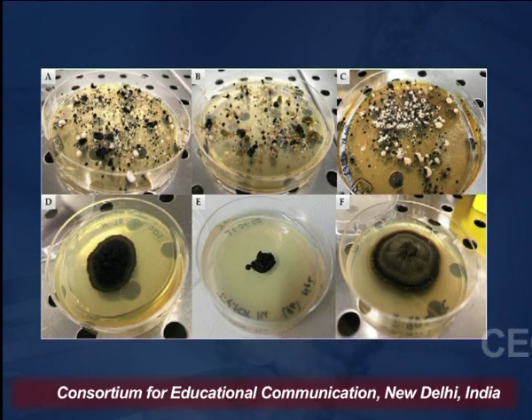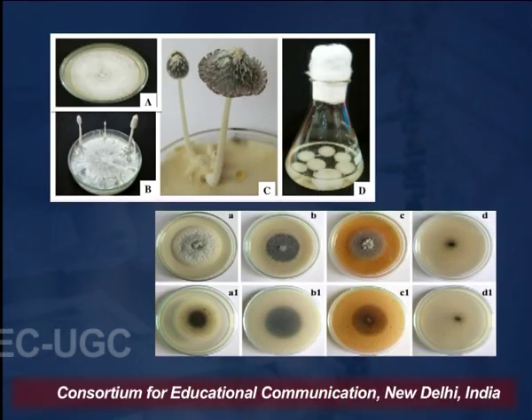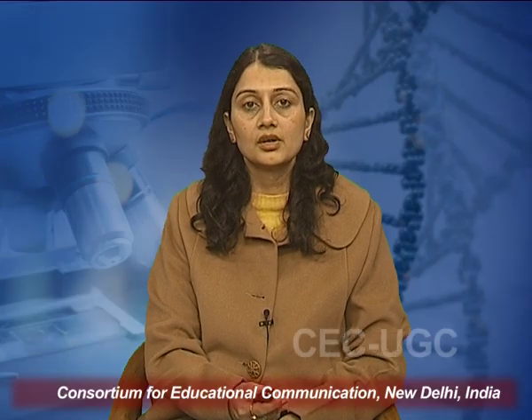In microbiology, you have to use a combination of physical and chemical disinfection techniques. So physiochemical techniques. This is how the fungal growth will look in the slides. Now let's discuss the growth media depending upon the functional type. Earlier we discussed the media depending upon the consistency. Now we are discussing based upon the function. There are three different types: enriched media, selective media and differential media.